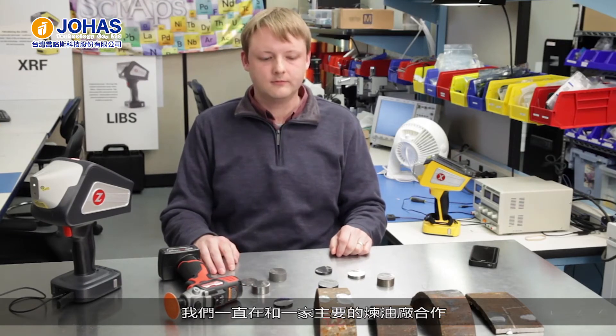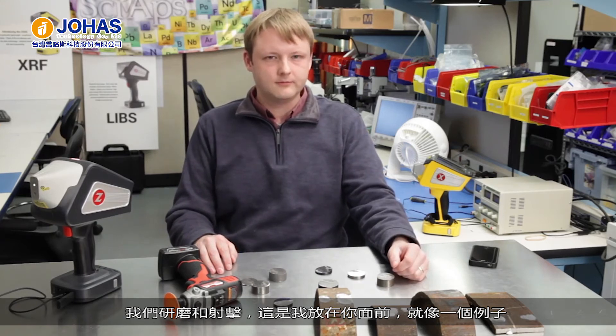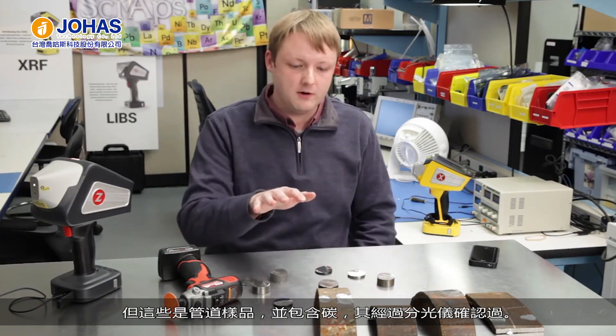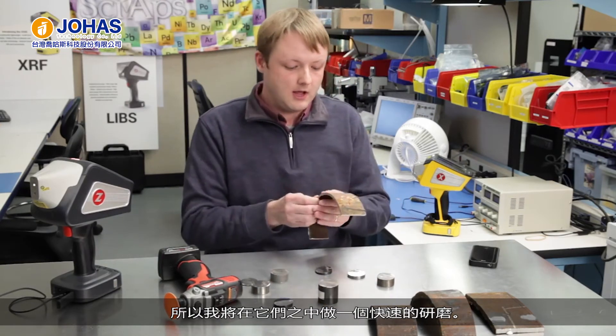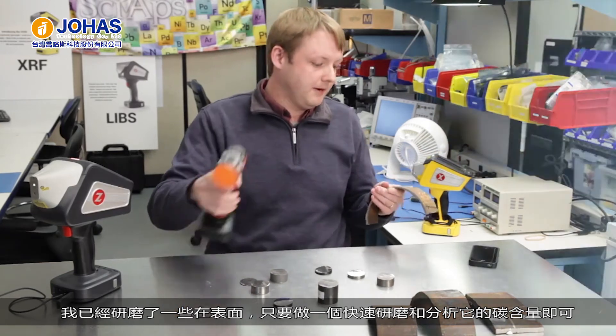A lot of our testing hasn't been just on nice CRM samples. We've been working with a major refiner who's given us some previously in-service piping components, which we've ground and shot. These pipe samples had carbon content and other elements verified by spark OES. I'll just do a quick grind on one of them — I've already ground a couple of spots on the surface — and test it for carbon. Depending on how much scale layer or oxide you have, you may only need a few seconds of grinding.